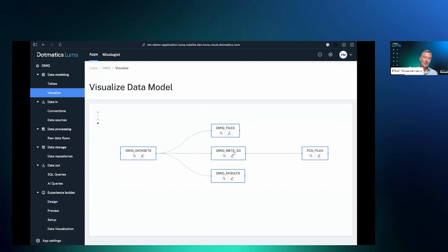Now, if you were eagle-eyed, you'll have noticed in those Omic folders in LabConnect, the raw FCS files were not in there. Again, we don't move them. There's only one copy. But in the metadata, there's a link out to them, and that's how we're able to draw this data model together. But we've still got JSON representations of these files, and then this nice data model.